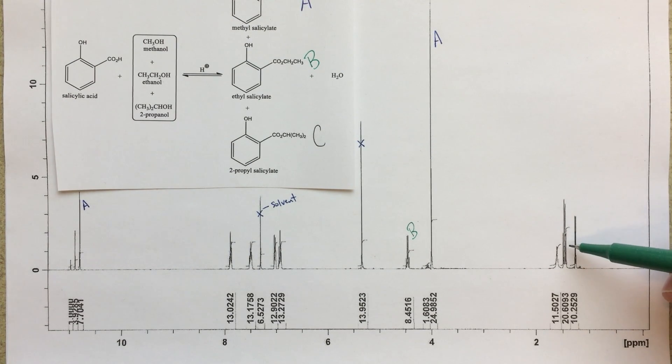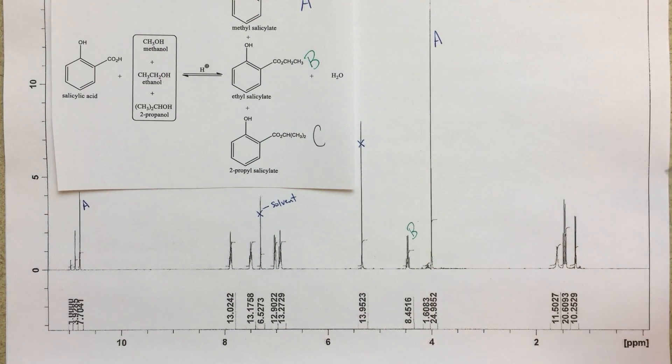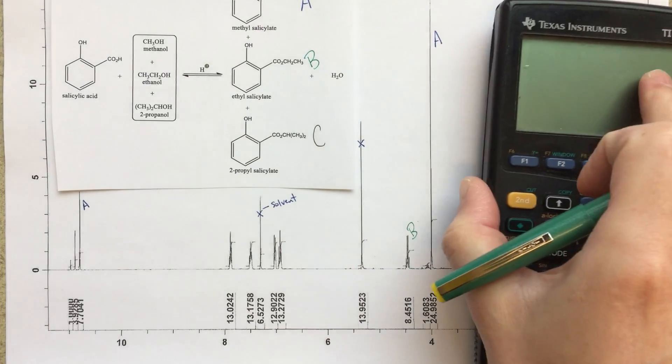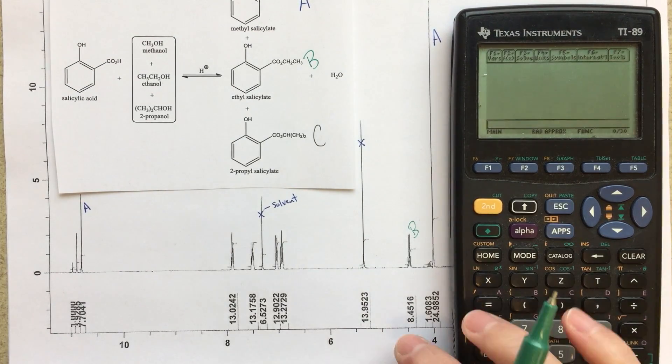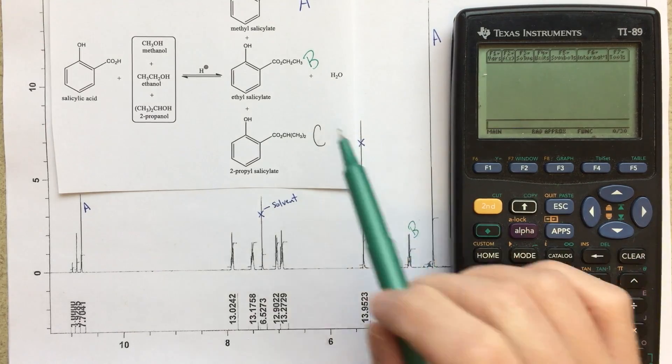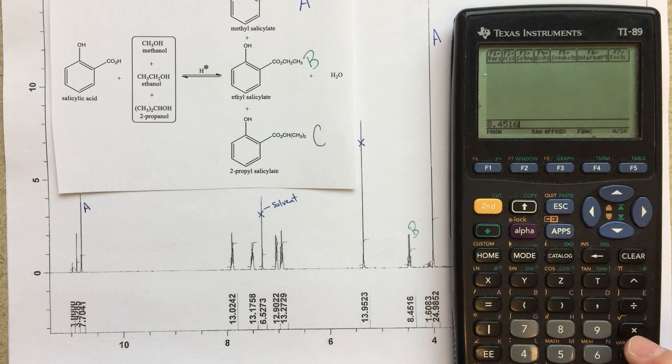This peak very clearly, I think, is a quartet. And you might get confused, you might think that this peak goes with this peak, but what I would do, and what I did actually, is I said, well, let's take the integration for this peak, which is very clearly the methylene linker, 8.4516, and let's multiply that by three divided by two.